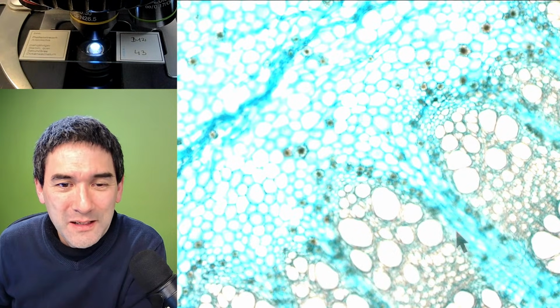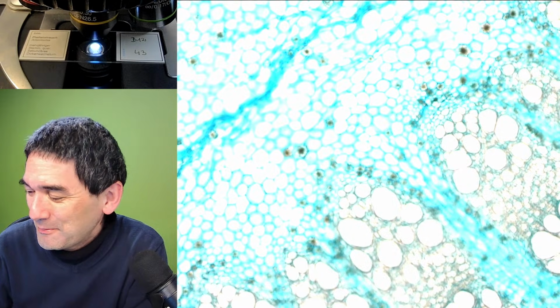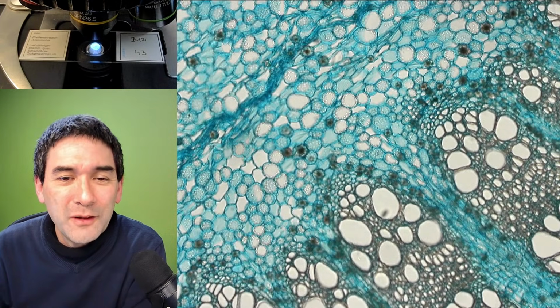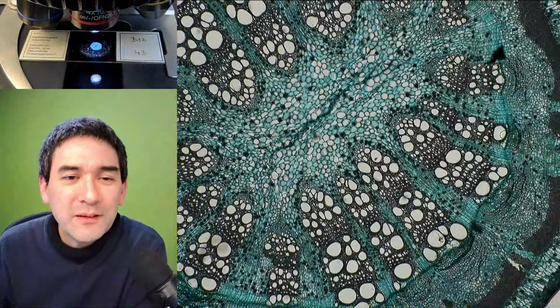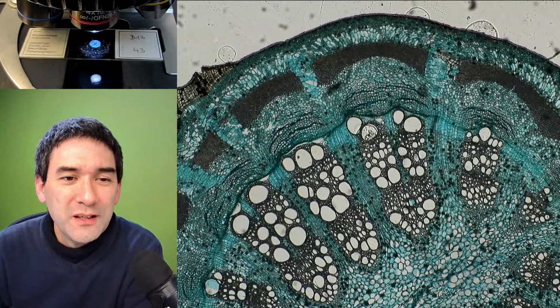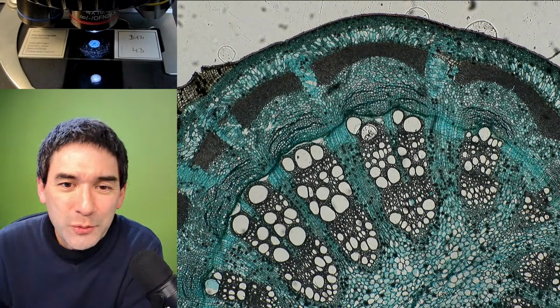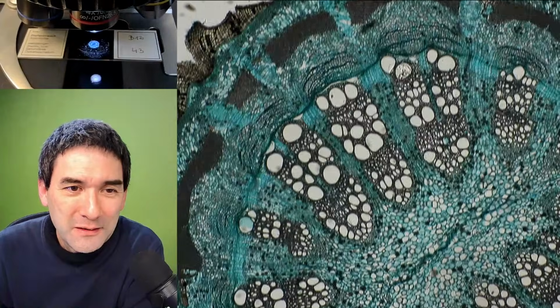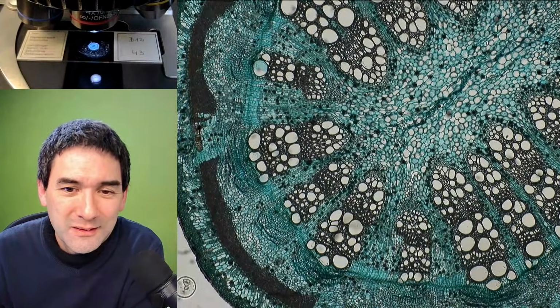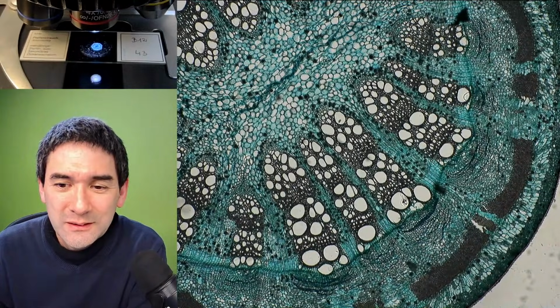It's a fairly large specimen, and for this reason I'm not able to fit everything on here. So let's go down again. Look at this. Here you can see again this ring-shaped arrangement of the vascular tissues, which is so typical of a dicot plant. The largest cells again are the xylem, for transporting the water.